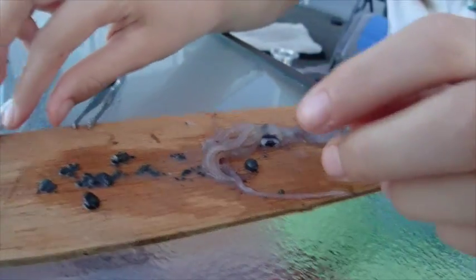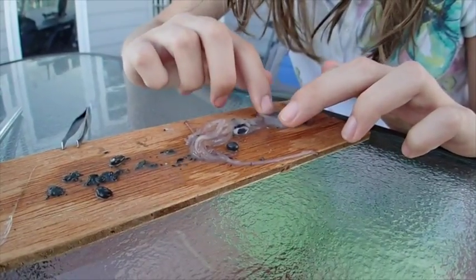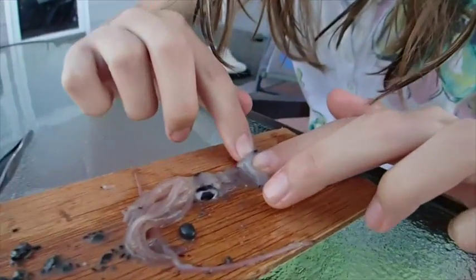Do these have a shell inside? Do these have any kind of shell, or is that pretty much it? That was pretty much it. Here's another ink sack — there are two ink sacks.